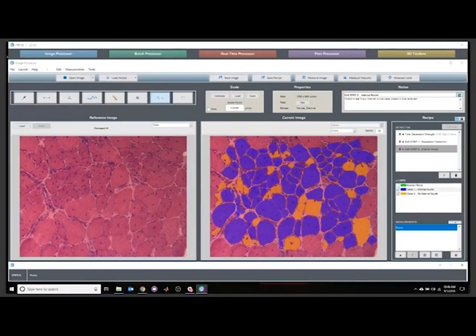But yeah, I went pretty quickly here just for the sake of time, to make sure I covered everything. But demonstrating here again in version 2.0 of MIPAR is this really simple recipe mode where we can view our layers very easily and control this interface from the simple view, exposing just the key steps for us without having to worry about the entirety of the algorithm.